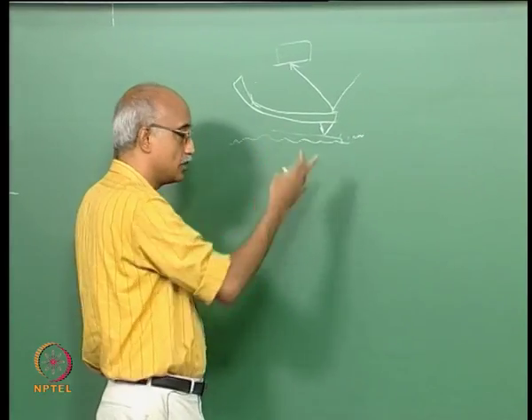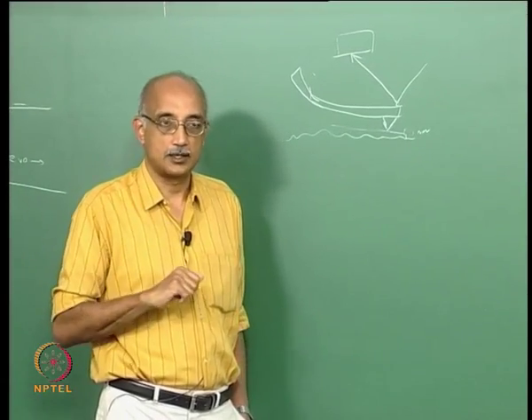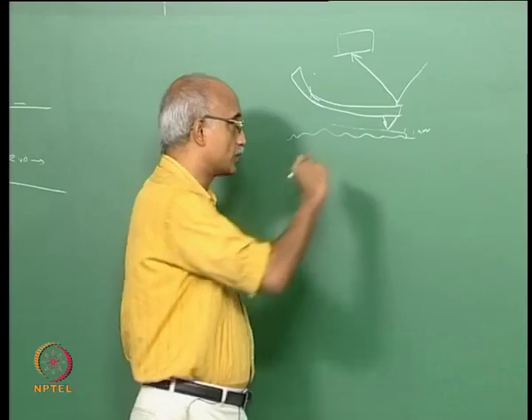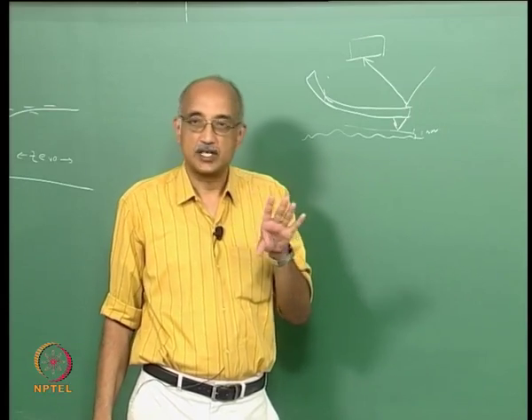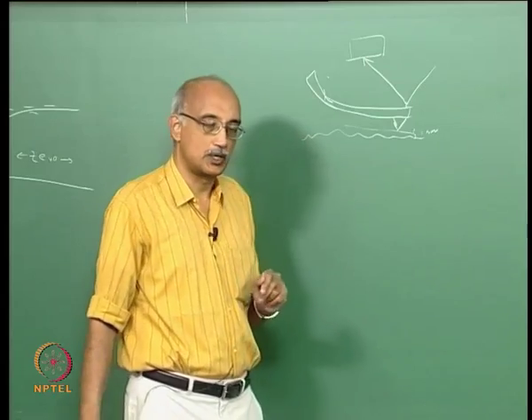So by making use of essentially a laser light bouncing off of the end of the cantilever, you can get a much stronger signal, and even very small changes in the force of attraction between the tip and the surface can be magnified sufficiently to be captured very sensitively using this cantilever arrangement. That's basically how this works.